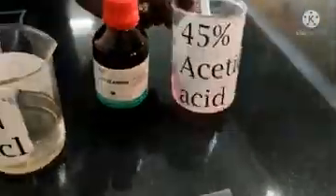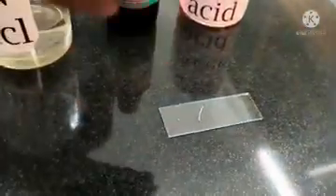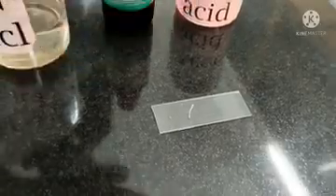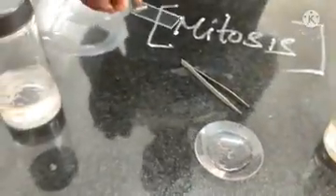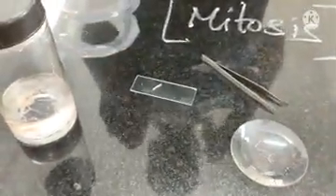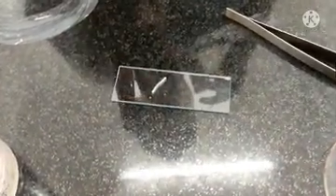Then this slide is prepared by putting 2 or 3 drops of this 45% acetic acid. Put a cover slip and tap that, so as to squash the material. Then this slide should be focused in a compound microscope, and for the preparation of this slide, you will get 3 marks.